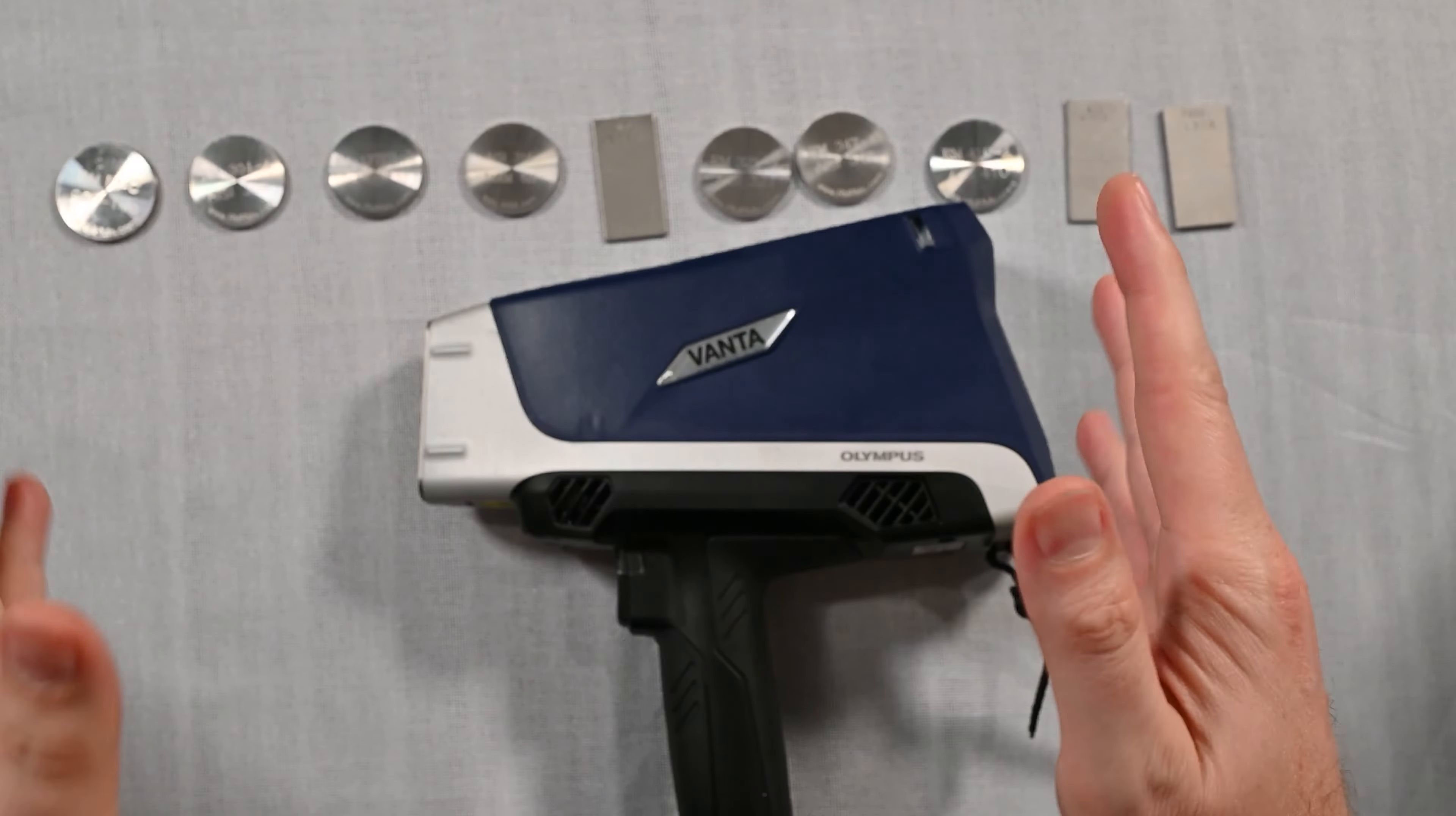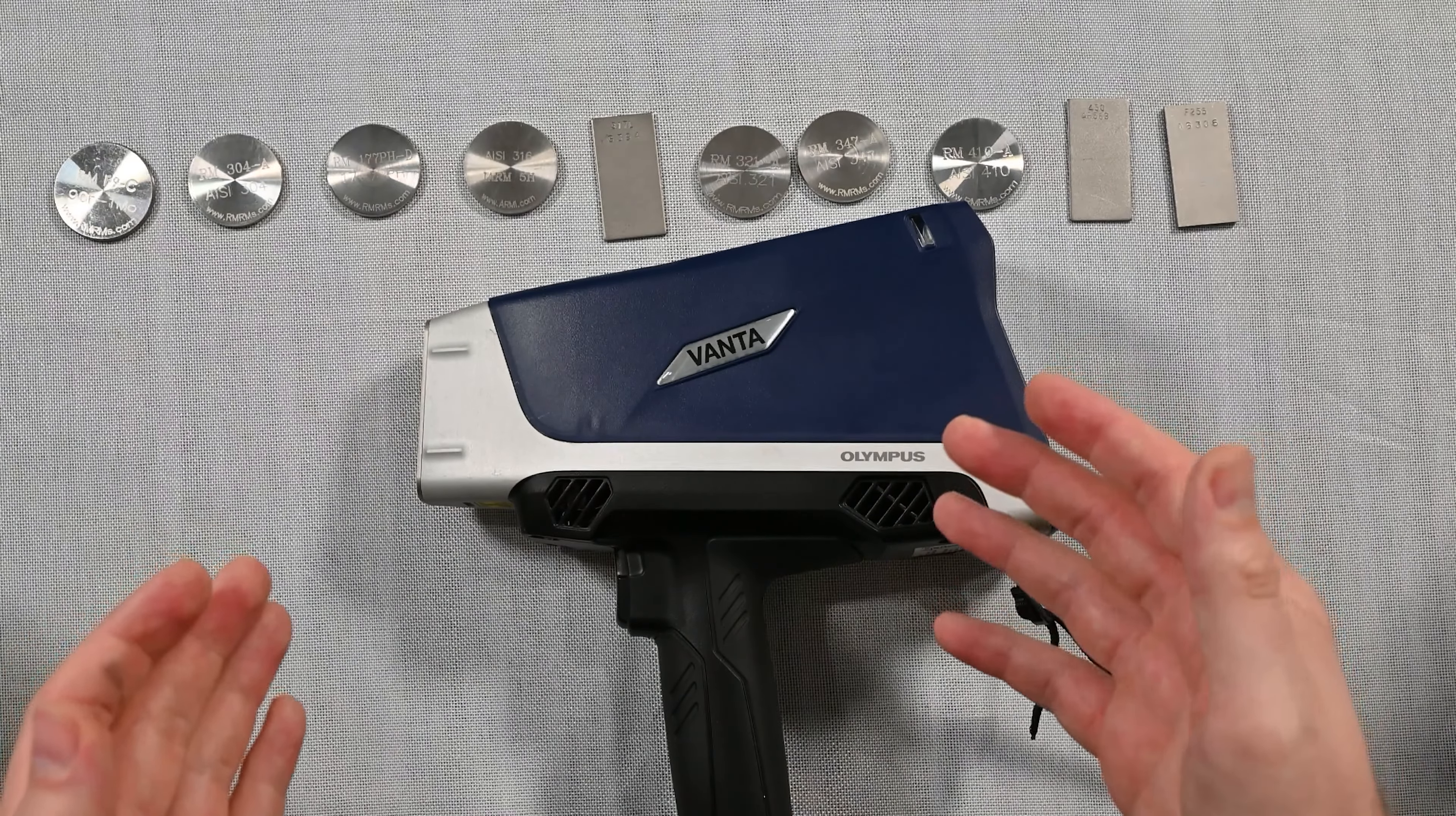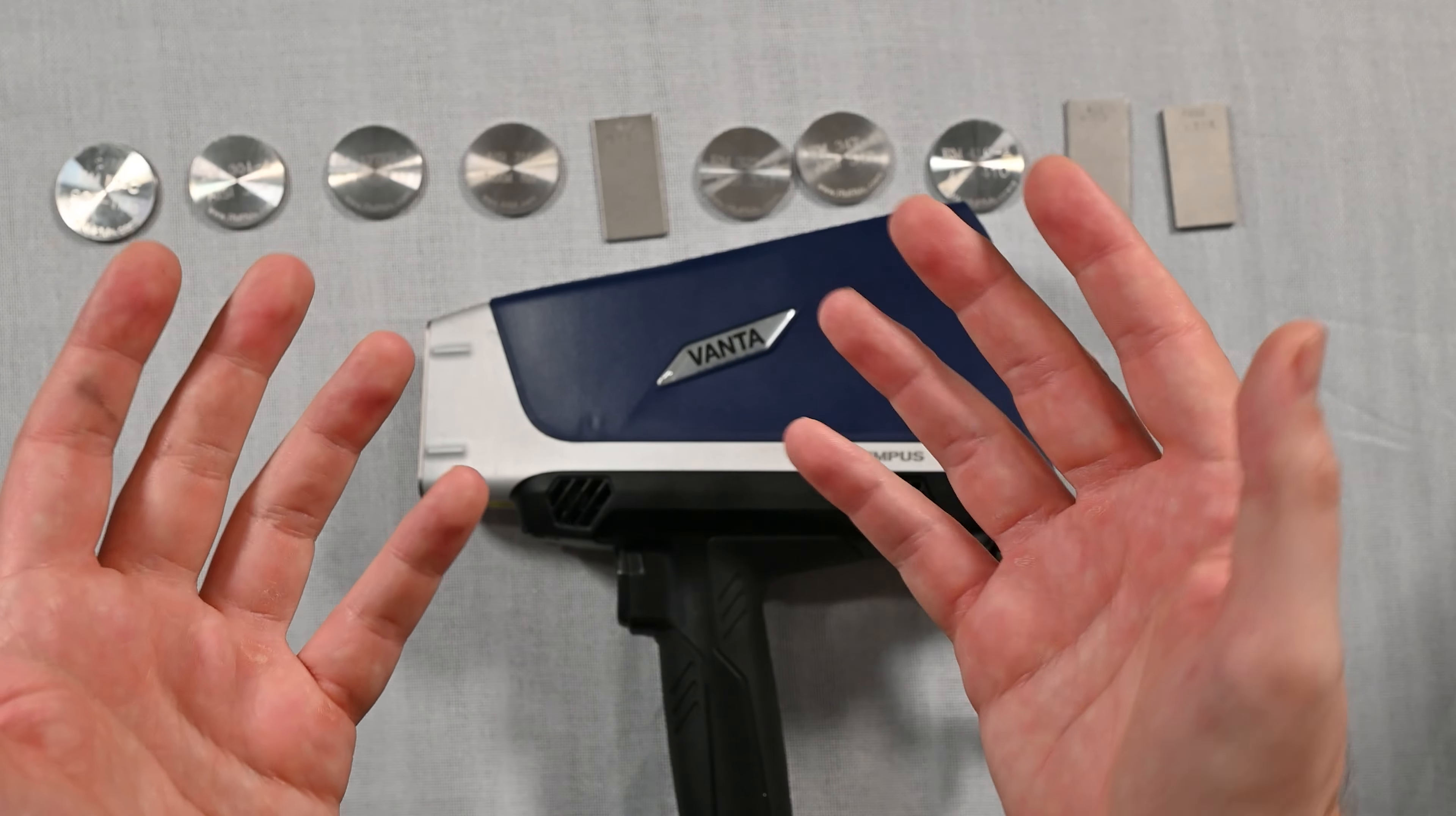Welcome back to Alloy Geek. In this video we're going to take a look at how to sort stainless steels with a handheld XRF. We have the Vanta Core by Evidential Scientific, formerly Olympus, and we have 10 different stainless steels here to sort. Just like in other videos we've done, we've got the alloys actually printed on the samples.